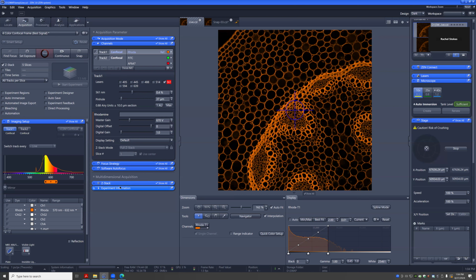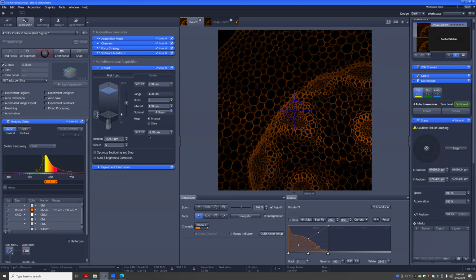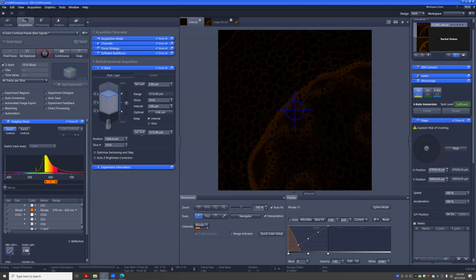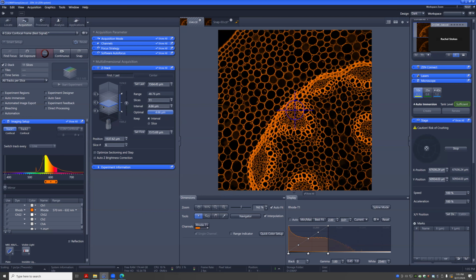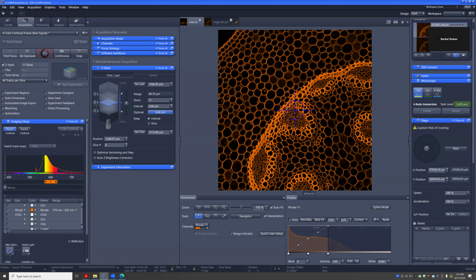So if we're doing a stack, there's really two main strategies. Really straightforward, especially if you're just doing a Z-stack, you can set a first and a last. You go top and bottom. It doesn't actually matter which direction you're going in. It'll know. If you set your last first and then your first, it knows relatively what position you land. And you see here your end slices, first and last, and your center. Double clicking on the center will just make it jump right over there.